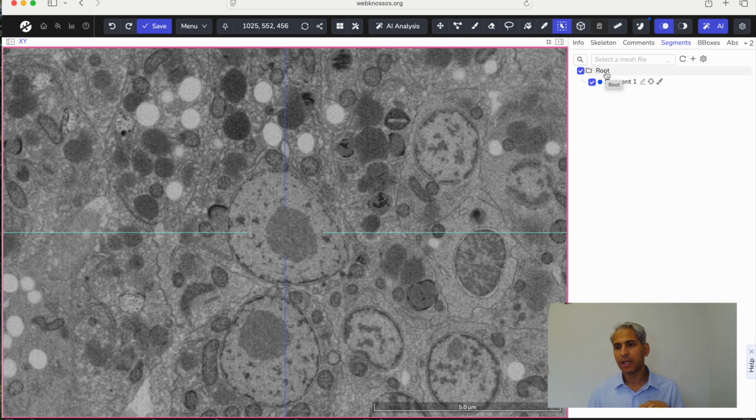By default, there's a root folder in which everything you're going to annotate will be in. But for us, we're going to have a particular kind of folder structure. The first thing you're going to do is to create a folder that is going to have all the annotations of your cell. So your cell has a name, and that will be the name of this first folder.